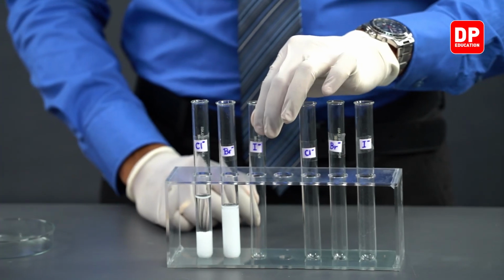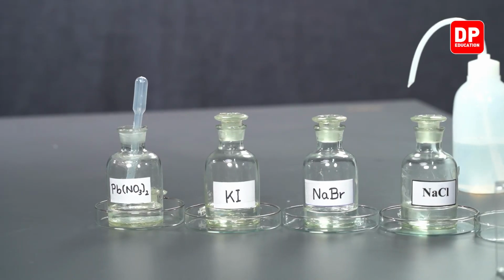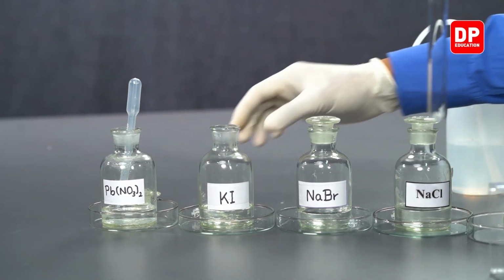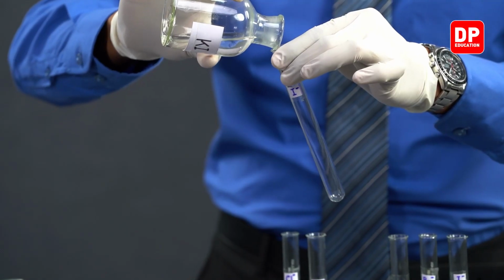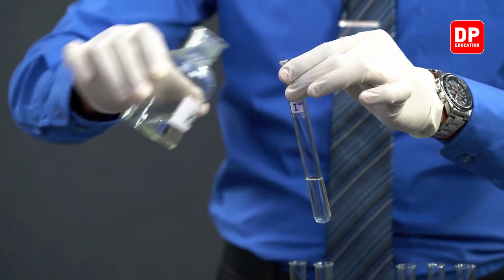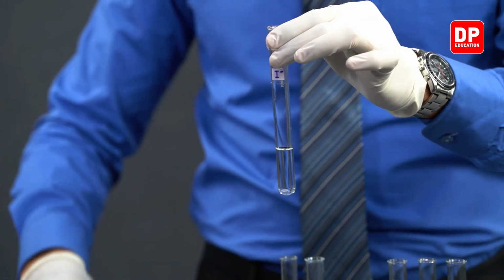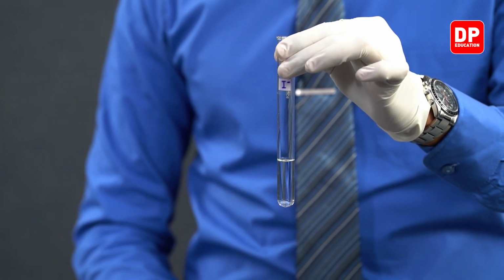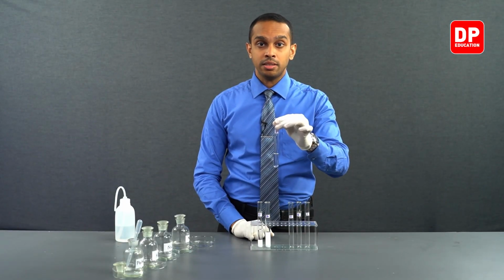And now let's move on to potassium iodide. We'll take a little bit of potassium iodide solution over here. In the test tube over here, we have a little bit of potassium iodide solution, which contains potassium ions and iodide ions.